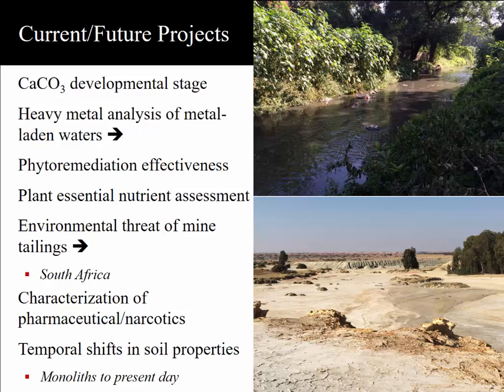I took the gun, David's gun, to Nepal. Carried it on the airplane, carried it through the airport, no problems checking it in or out. Used it in Nepal. They were concerned about rock crushing plants trying to make aggregate out of rock, pulling rock out of the river, crushing it, and then selling it. But the powdery residue they were dumping right back into the river, and the local citizens near Hetauda were very concerned that there were metals in the rock that might be polluting their drinking water. And of course, they use it for irrigation as well.